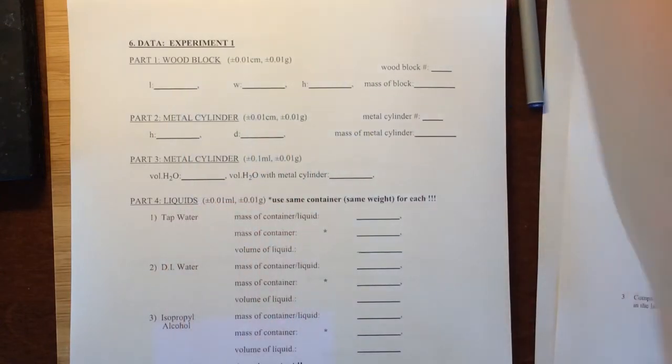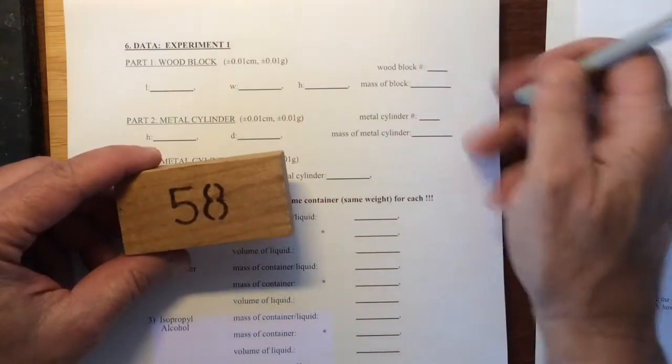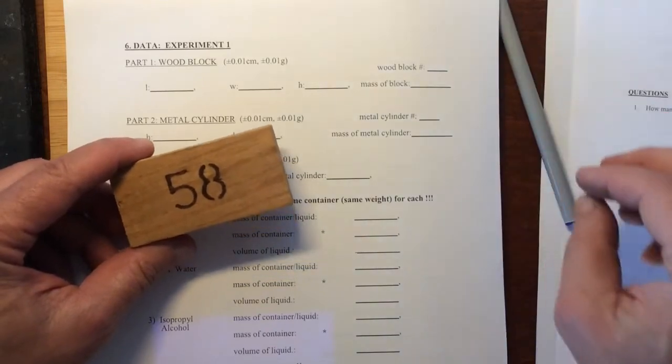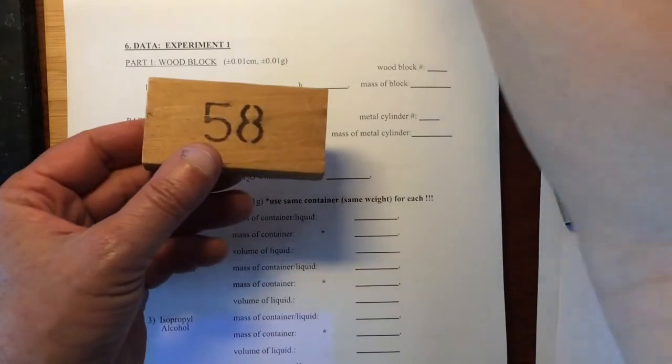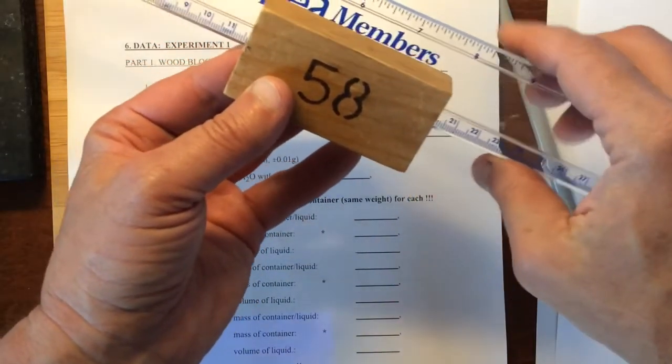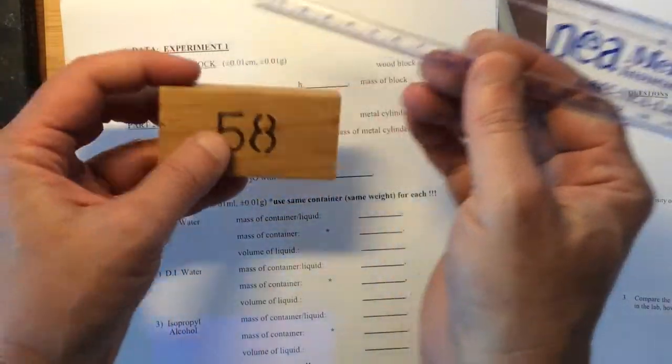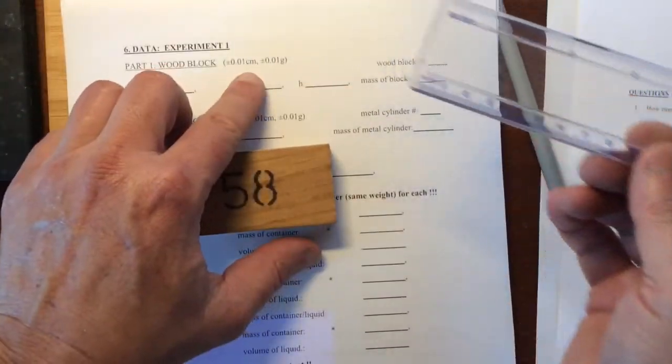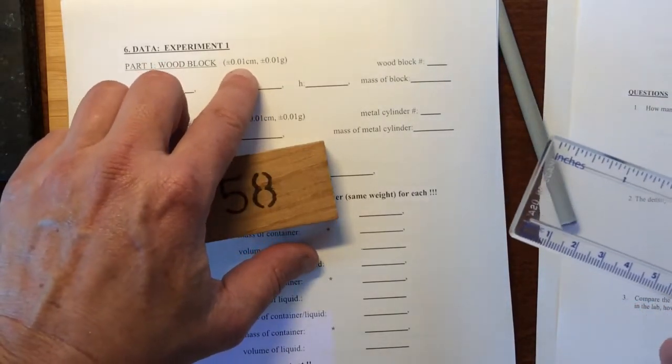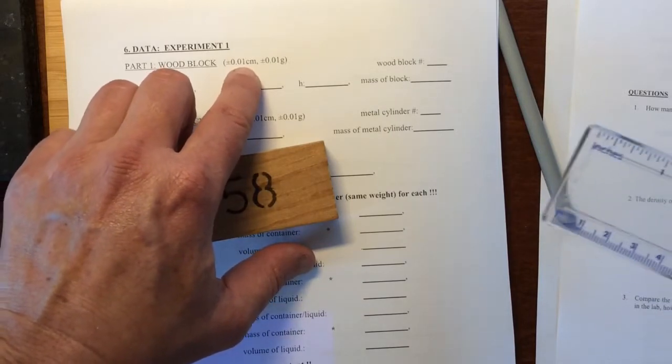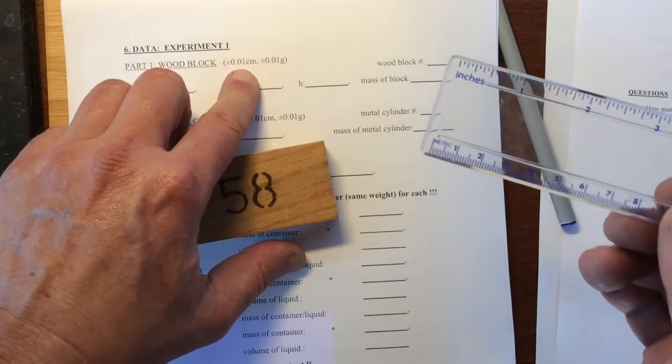We have a series of little blocks. This one's block number 58, so up here we'd want to write 58. It doesn't really matter what we call our length, or width, or height. What's important is that we get the three unique axes, and that we use our metric side of the ruler. The directions say read things to the plus or minus a hundredth of a centimeter. That doesn't mean we end in a zero, but rather we read as well as we can, even if we have to sort of make a guess, to the hundredth of a centimeter.